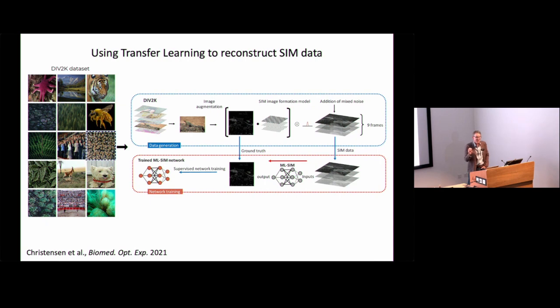There is a small problem with this, and that is, for people who use SIM, structured illumination microscopy, in contrast to the grating approach, we have one difference, and that is we cannot control the phase stepping as accurately as we can with the grating approach. So that means for different colors, the phase steps are not equidistant. So I do image 1, 2, 3, like that, image 1, 2, 3, like that, image 1, 2, 3. The steps between those are not quite the same for all the colors. And that means that this classical Fourier reconstruction that I mentioned earlier doesn't work. The classical ways of reconstruction don't work.